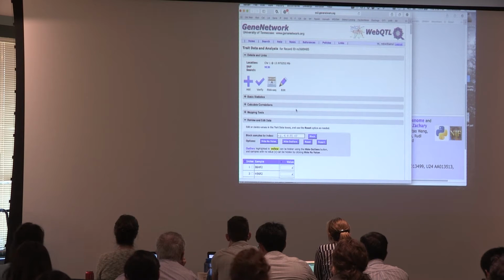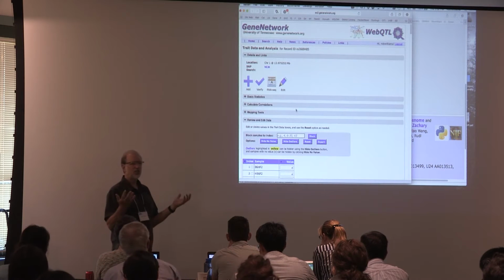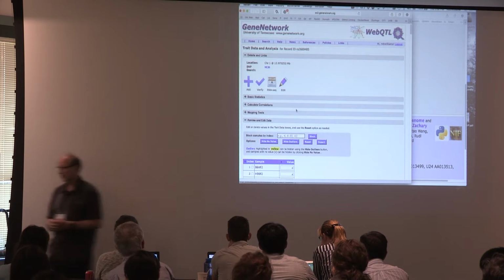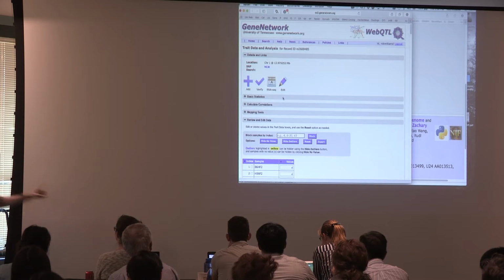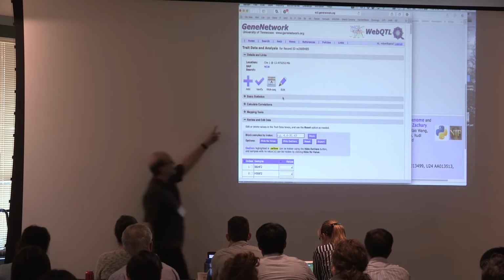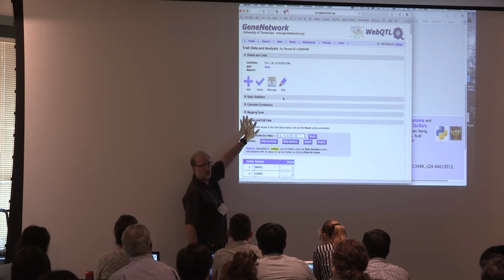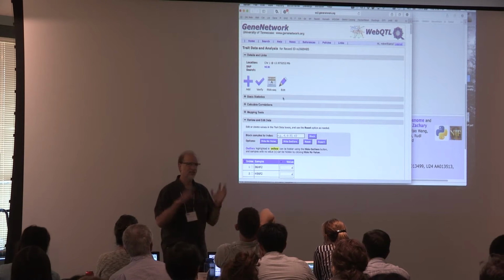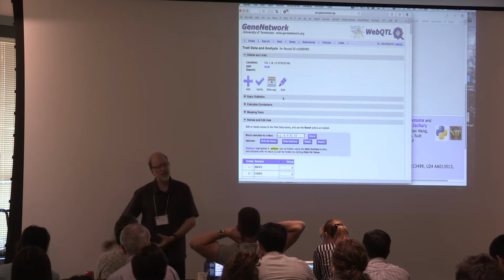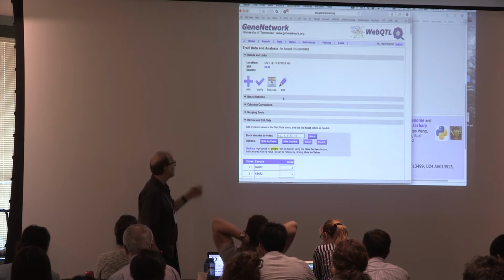I can say, what is the correlation between this particular marker and gene expression in the liver? The way this is structured in Gene Network, you'll see we've got our univariate statistics. Basically, there are 3 bands here: univariate, bivariate, and then gene mapping tools. And you'll want to do multivariate, or complex analysis. So basically what you do is you export things into your shopping cart. There's a shopping cart metaphor here.